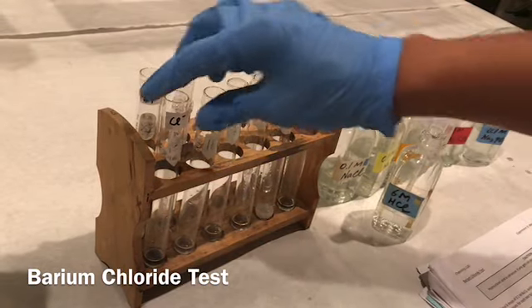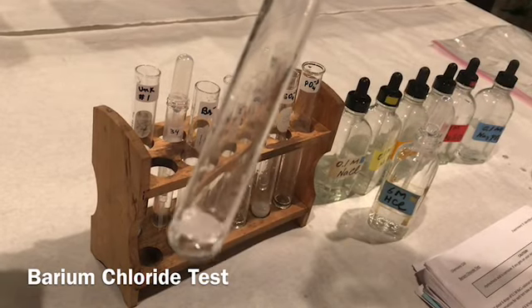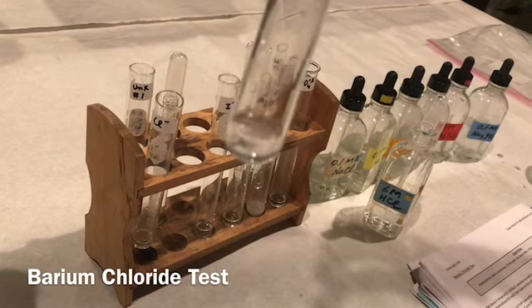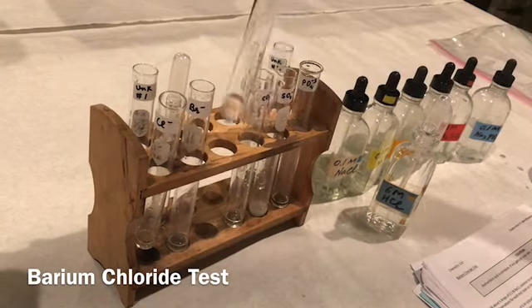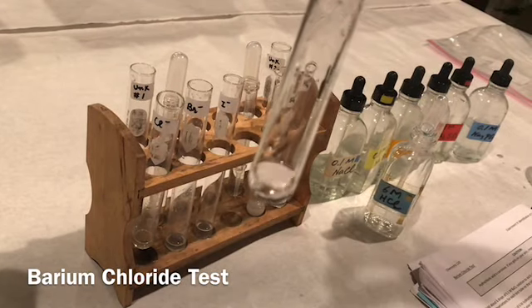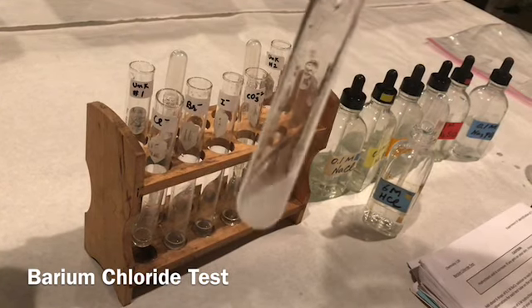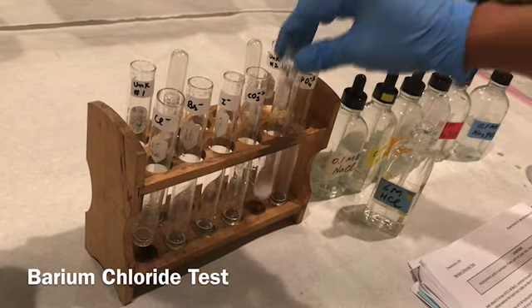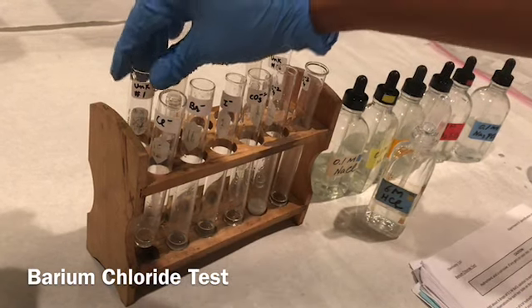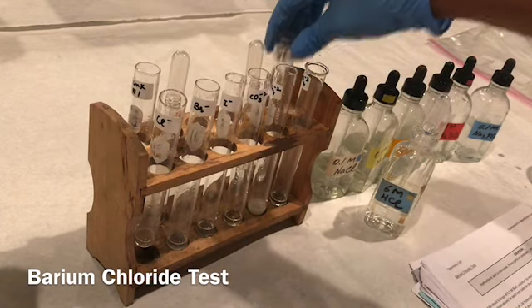Okay, so now you can see the observations again for chloride ion after adding the 6 molar HCl, bromide, iodide, carbonate, sulfate, phosphate, unknown number 1, and unknown number 2.